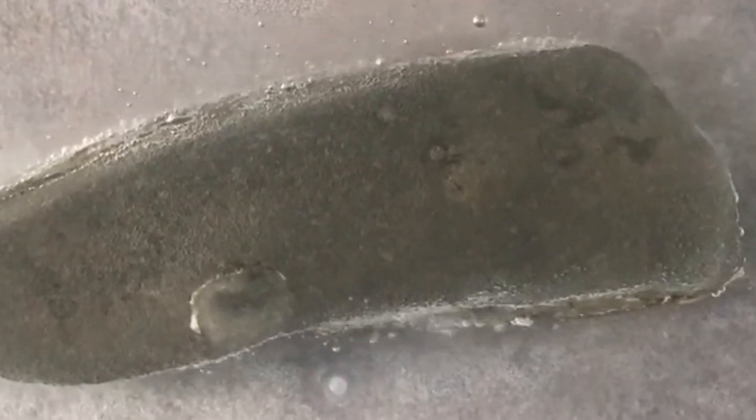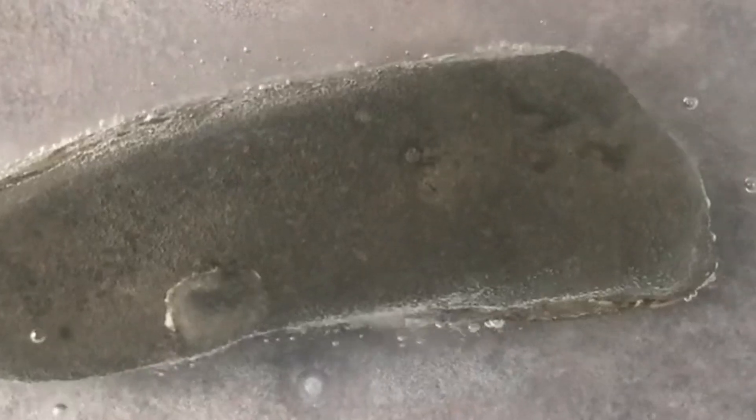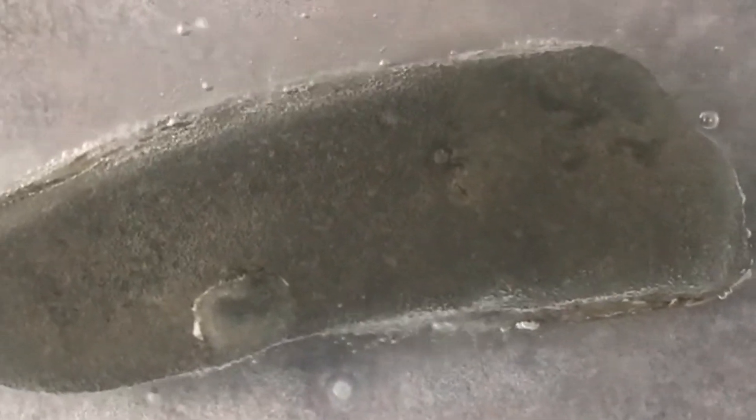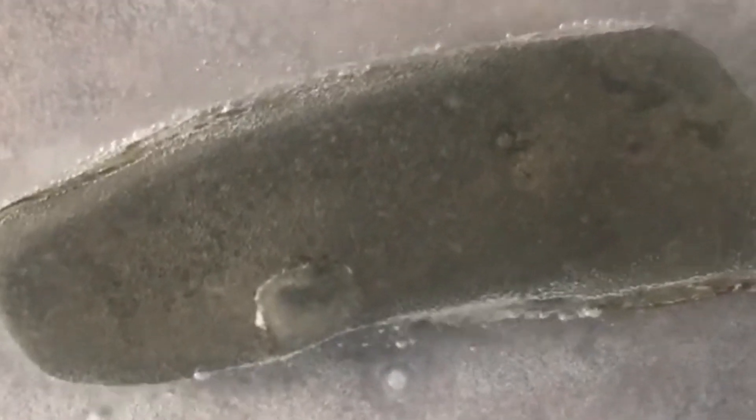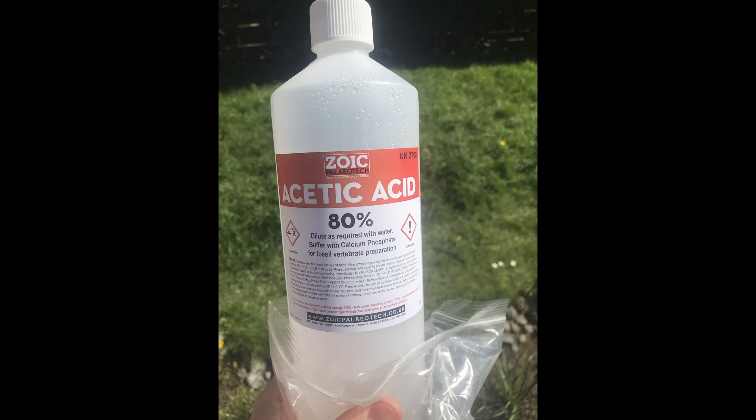Today we're going to do a different sort of video. This is going to be acid preparation — previous forms of preparation I've done are mechanical, primarily driven by the Dremel 290. With acid preparation we're relying on an acid, in this case acetic acid, to dissolve away the rock and leave us with our fossil.